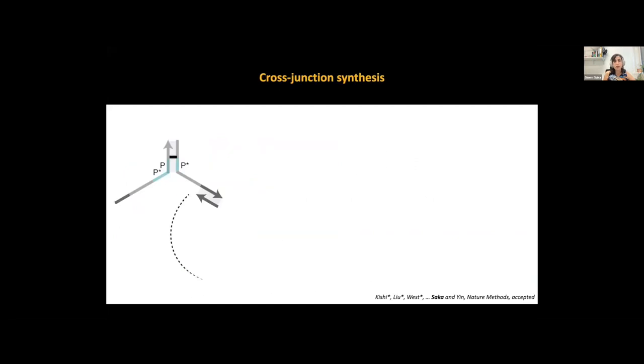For this, we came up with a cross-junction synthesis, and it has some inspiration from the primer exchange reaction I've previously talked about. So the way this works is, think of this as a docking site that we have in situ, and this is our CNVK barcode. If we now use this as a template using a DNA polymerase, so this would be the primer, and then we copy this out, this part would be essentially acting as a bit of a stopper, because the polymerase normally would not be able to jump through this. But we have designed some internal complementarity here to aid this process.